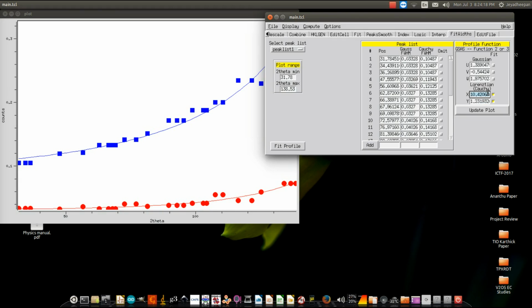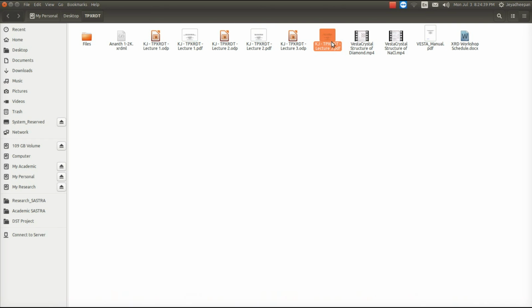So here there is no experimental pattern, and there is no calculated pattern. And here also, earlier the calculated pattern was here, but now it is not there. And here also the earlier calculated peak was there, now it is extinct because of the application of the space group here. Here also one peak is extinct. So now all the experimental peaks are exactly matching your calculated peaks.